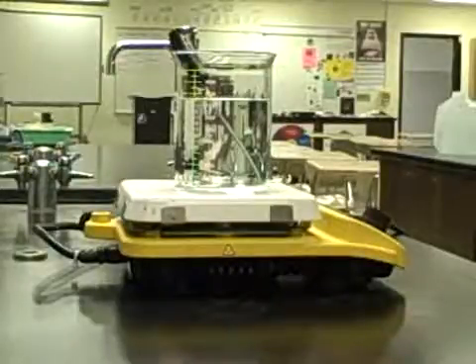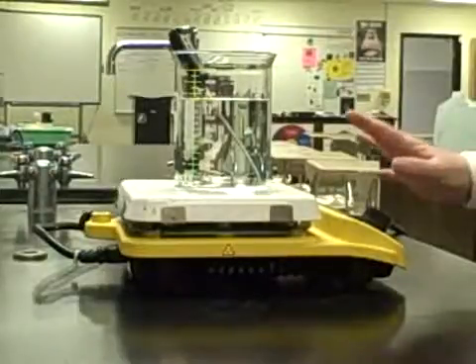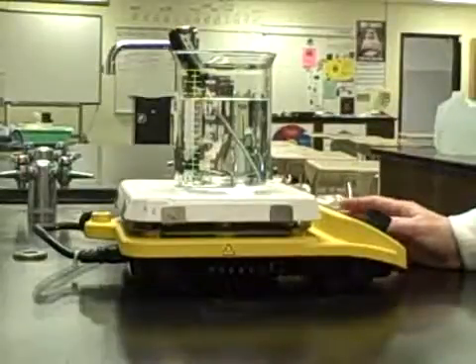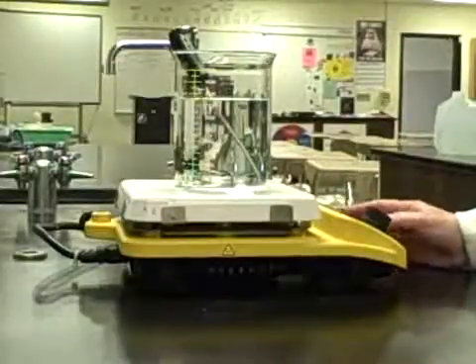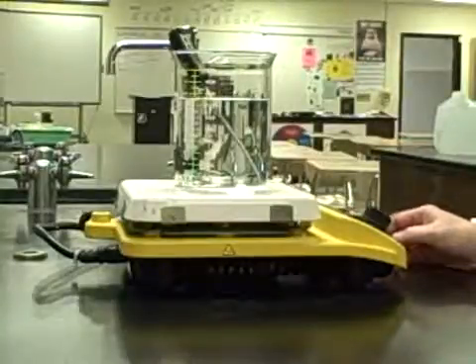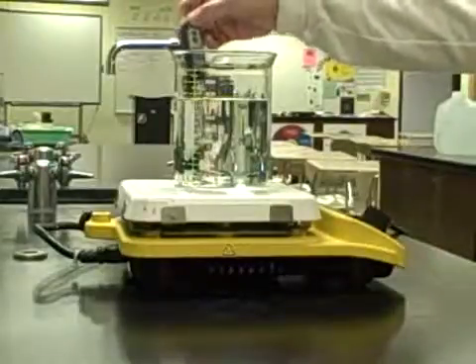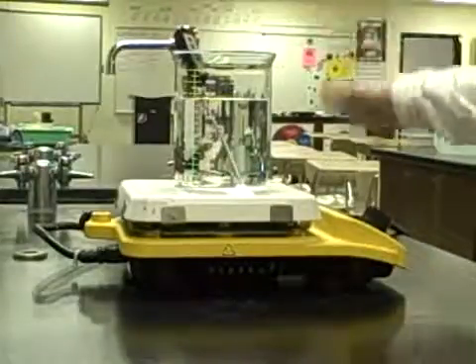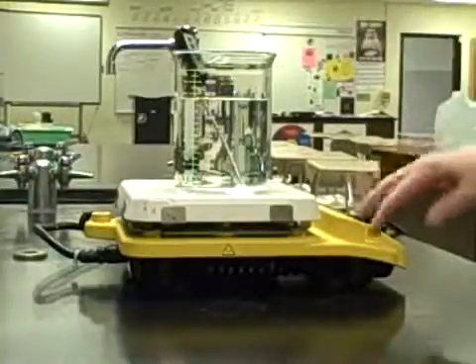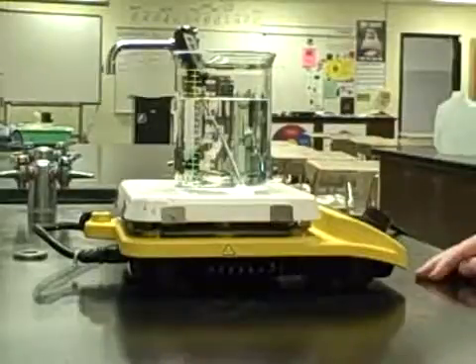So I'll have the water baths set up, the 5 water baths. I will have a label at each station telling you what temperature it should be, and we'll get 5 volunteers. Basically your job is to make sure they don't get too hot. We don't usually have a problem with them being too cool, but there'll be a thermometer in there, and if you're assigned to one of the water baths, you'll have a beaker of ice there so you can add ice as you need to, or you can adjust the heat on the hot plate as well.